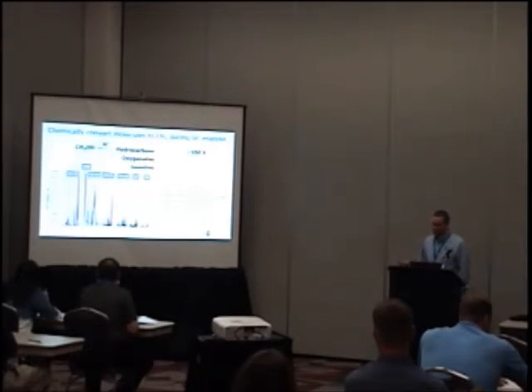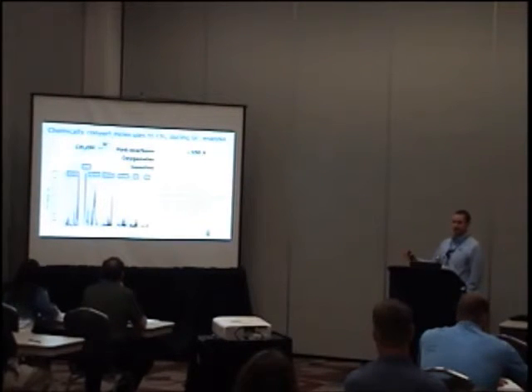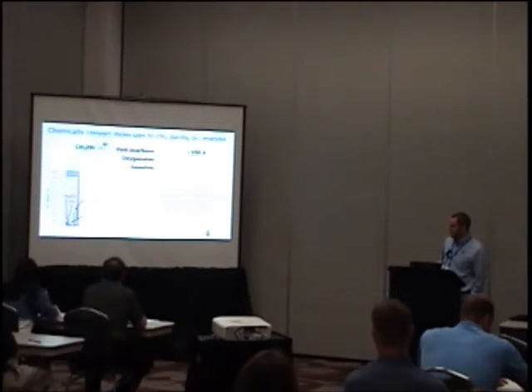We could also group these peaks into C4, C5, C6 lumps and get an entire concentration of that lump just by integrating that, co-eluting peaks and all. So we can also look at some peaks down here early on which weren't apparent at all with the FID-only signal. If we look closely at that, what we see on this 1% phenyl column is CO, CO2, and formaldehyde, a large amount of formaldehyde that we didn't see at all with just an FID.